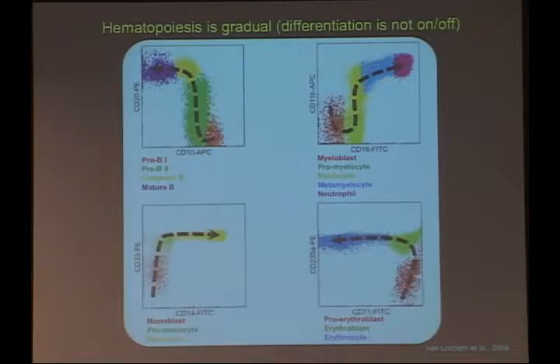The third incentive here is that there are relationships in the data that we can probably take advantage of. And so I mentioned that there's continuous relationships that we like to segment with polygon gates. But this is from a review in 2004. There are lots of these beautiful sigmoidal relationships through the data, nonlinear relationships and surface marker expression patterns as cells differentiate. So this is bone marrow and 4 different differentiation pathways for B cells, granulocytes, monocytes, and erythrocytes. And you can see these continuous patterns and where the immunologist kind of broke these up into different groups of cell populations.